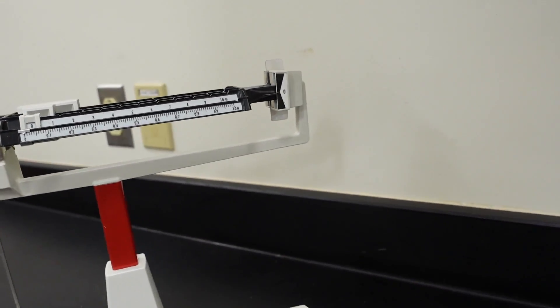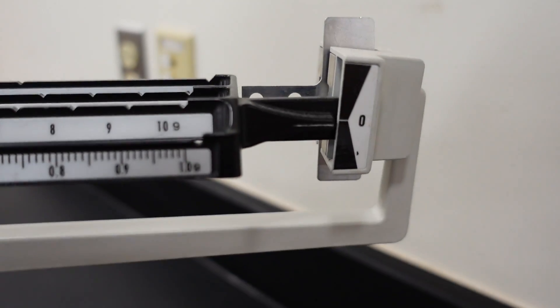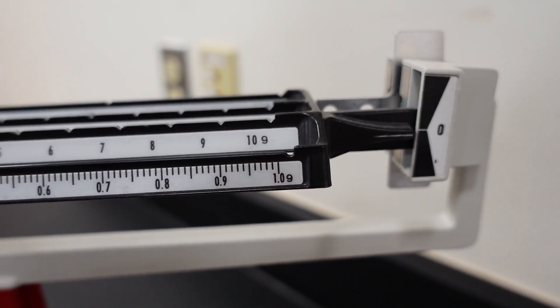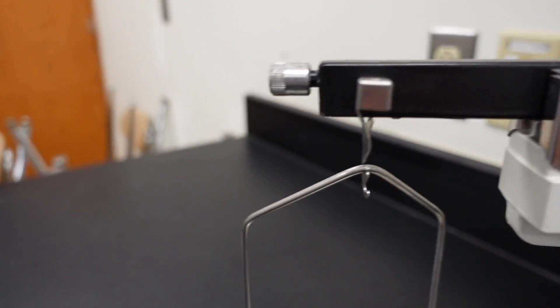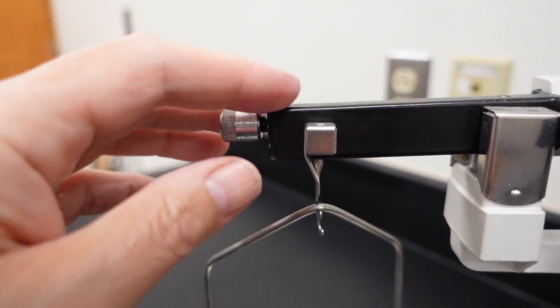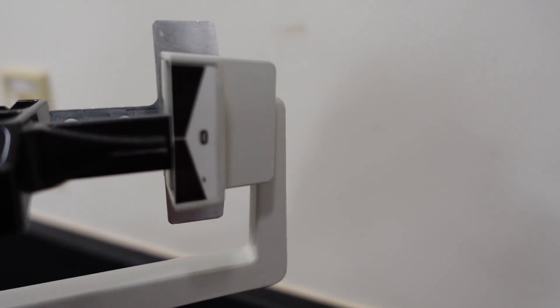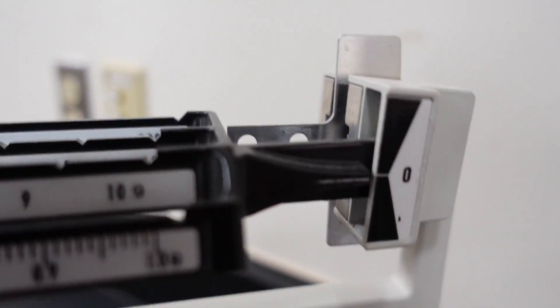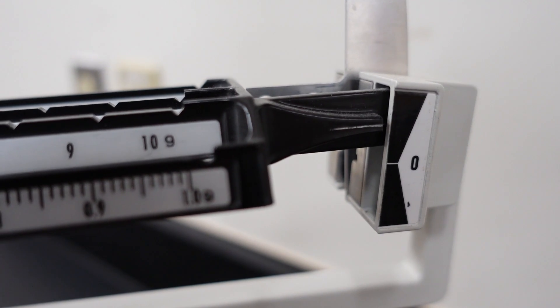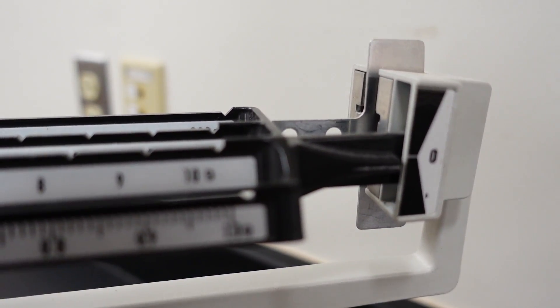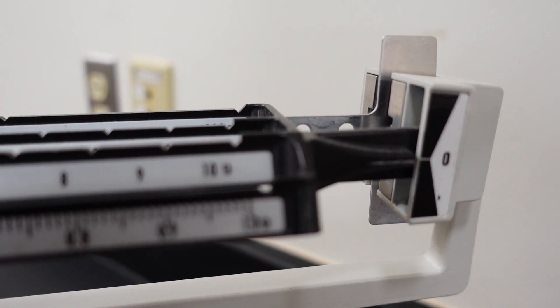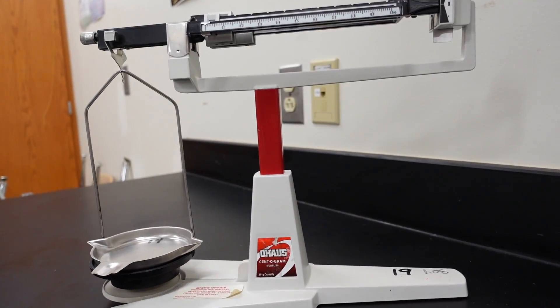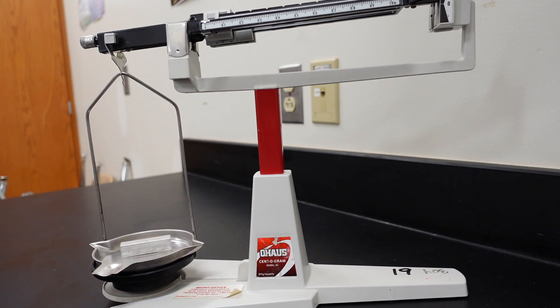Now, how do we know if the balance is even? Well, we take a look over here, and you'll notice that it's not quite lining up. So, what we do is we just simply turn this knob on the end. And, let's see what that does. It's a little closer. Let's turn it again just a little bit. And, there we are.